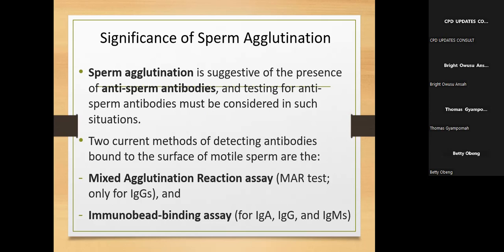Similarly, you get sperms that are supposed to move, but they are unable to move; they have aggregated together. You see that this aggregation is not a matter of some debris causing cells to stick to each other and preventing them from moving. That becomes an agglutinate. You could suspect that there are anti-sperm antibodies, but that is your suspicion. Then you have to do a test for anti-sperm antibodies. I hope my point is clear here.